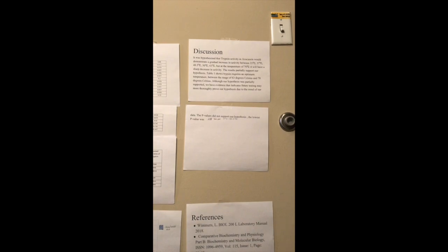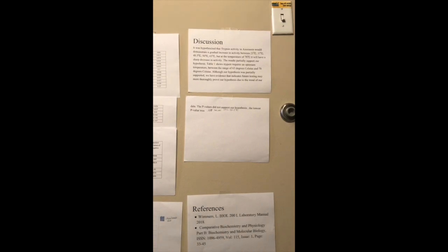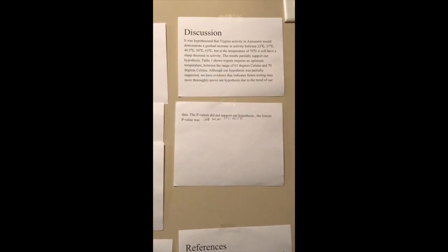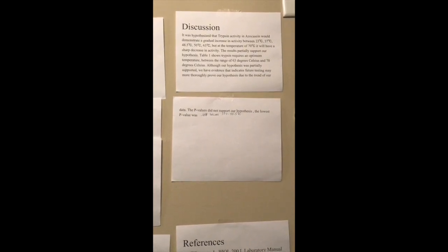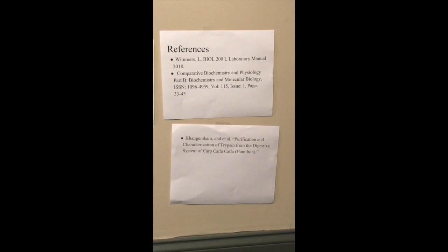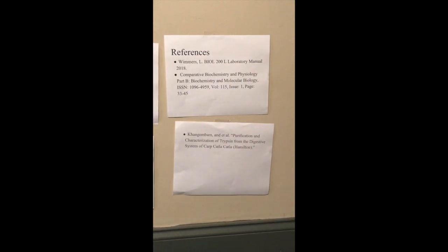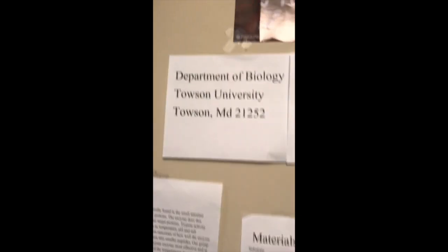Some problems with our experiment could be due to mistakes while micropipetting, prolonged incubation, or the lack of TCA added after the incubation period. Overall, a better design may include more organization and more ranges of temperature in order to prove our hypothesis. Overall, our results seem to show that enzyme activity does increase as temperature increases, but we do not have a relation to our hypothesis.